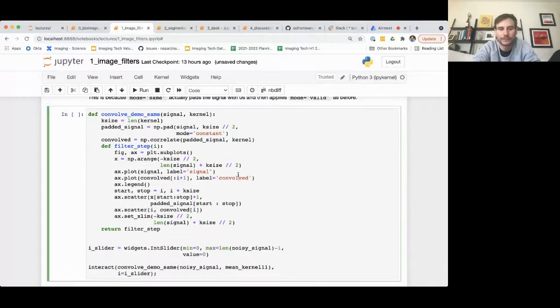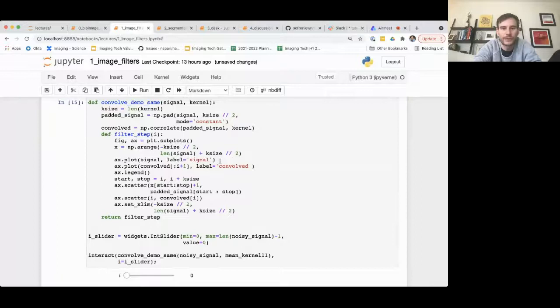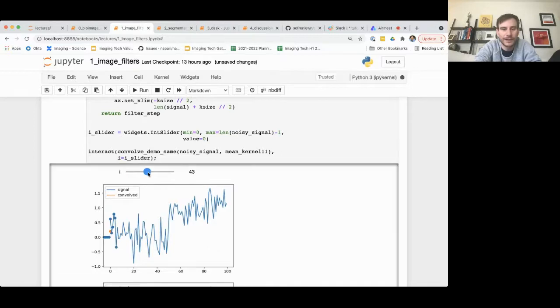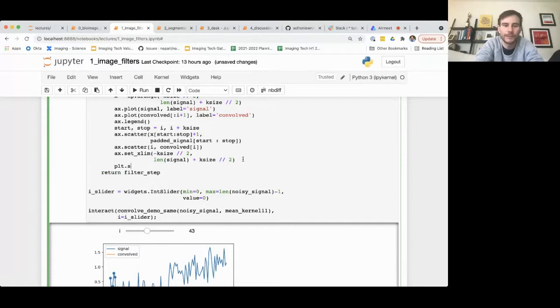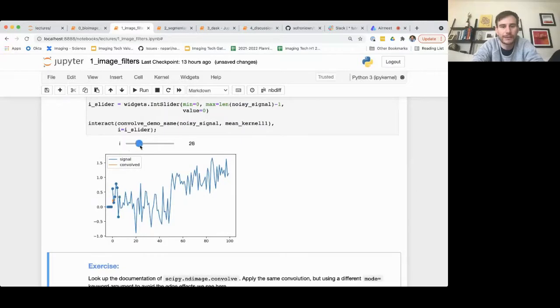And so you can look at this again. Now we're using a constant padding, and you can see that I didn't add a plt.show. So everyone that runs this is going to have a little problem now, because I forgot to add a plt.show here. Now if you run this, you can see that I'm averaging much more accurately in the middle of the region.